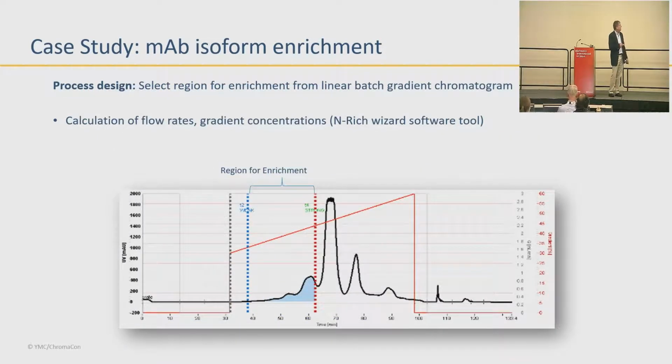So the first step is to find where they're going. They did this one in steps, and part of it is because some of these big ones are pretty big. They may not have had to do Enrich to really get a lot of material. They probably could have fractionated those as they were going along, as they were enriching this front part, sending that piece from column to column to column. They could have isolated these with a fraction collector on the fly. I mean, that's all within the capabilities of the instrument itself.